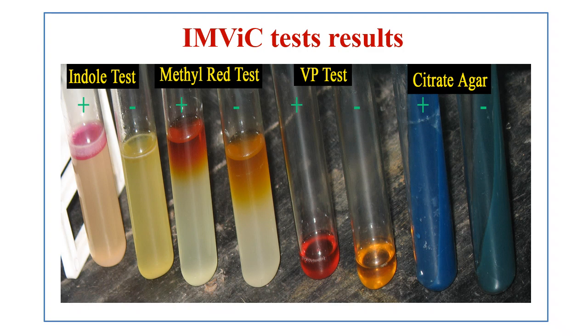We check which tests are positive and which are negative, and these are useful for differentiation, especially between the coliform bacteria like E. coli and Klebsiella pneumoniae.